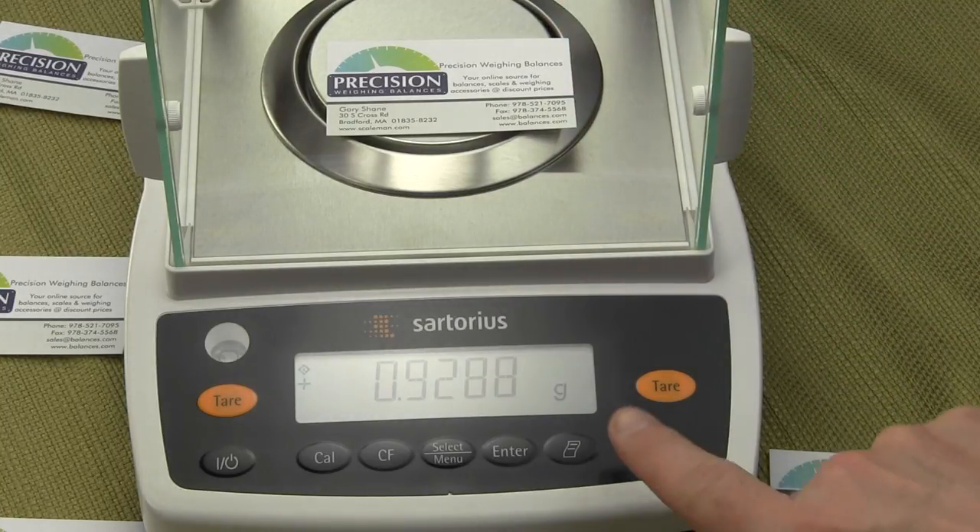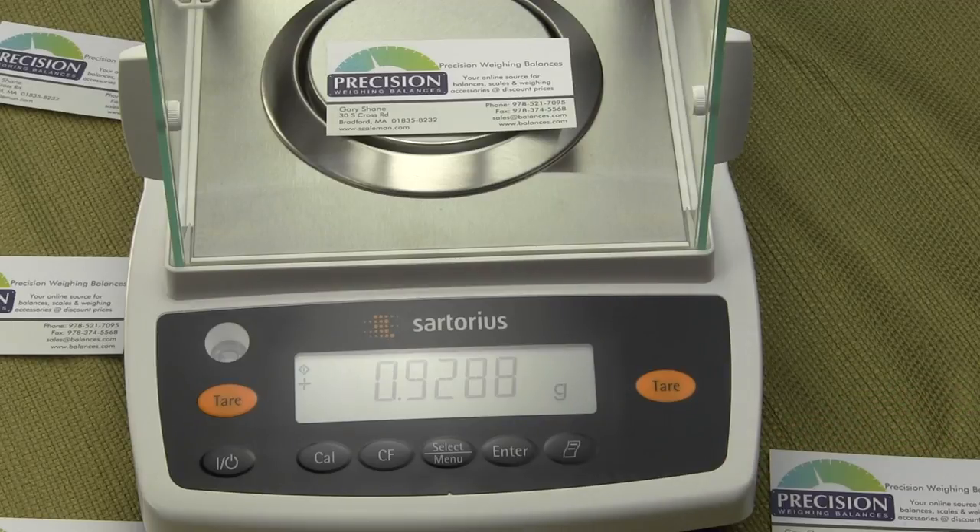You'll notice the balance is in grams — shown in the lower right-hand corner. To configure the balance so that it weighs in grains all the time, we need to change the configuration of the primary weigh mode. To do this we need to get into the application functions of the balance, which is done by first pressing and holding the select menu button.